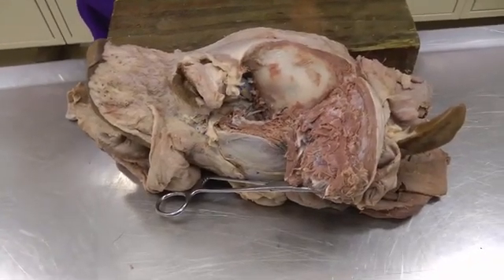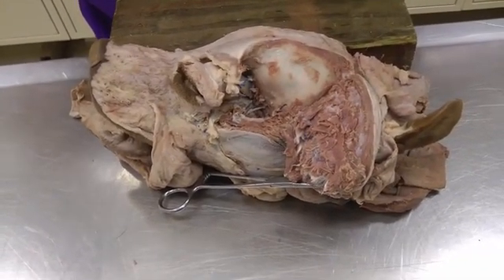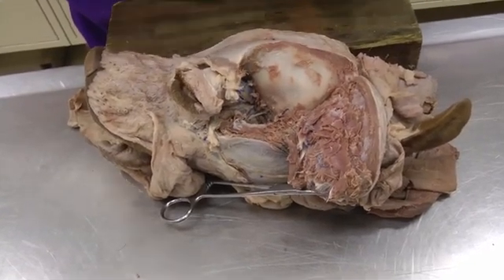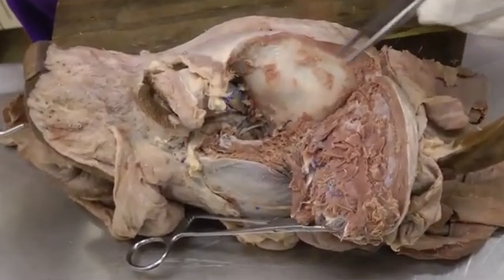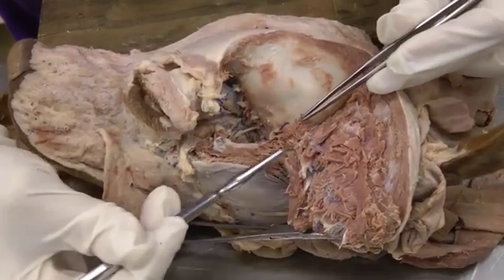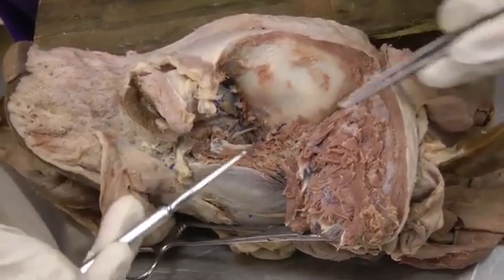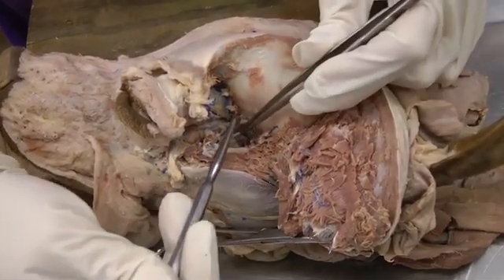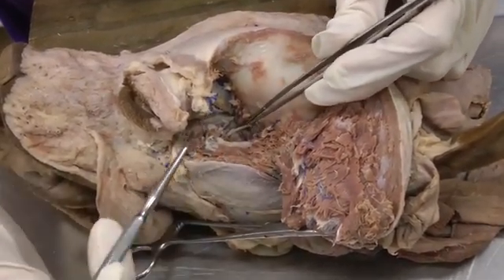This is lab 24 on the dog specimen. Today we're working on the eye and then a few of the superficial veins of the head. We're on the left side, which should have had the zygomatic arch removed and the temporalis muscle either removed or reflected so that you can get into this area to dissect the eye.